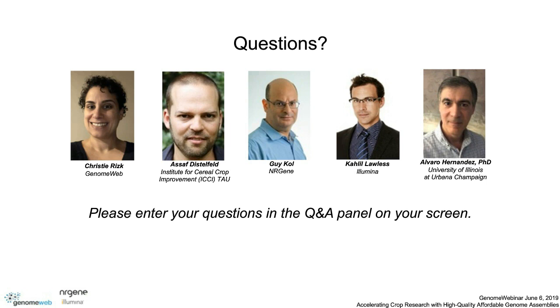So we actually come across this situation quite often when people want to compare diversity. They have partial coverage of some of the diversity, but they don't have any good reference to work with. So our recommendation in this case is pick one of your major lines, assemble it to high quality, and then we can very efficiently and very accurately compare the rest of the diversity, represented here by the, I would say, legacy data, to this newly created genome that was just assembled.